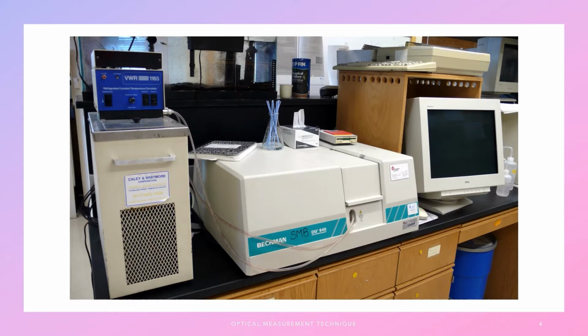Hello, my name is Nabila Aisyah and I will talk about the application of ultraviolet visible spectroscopy. UV visible spectroscopy is widely used in the field of analytical chemistry, especially during the quantitative analysis of a specific analyte. For example, the quantitative analysis of transition metal ions can be achieved with the help of UV visible spectroscopy. Furthermore, the quantitative analysis of conjugated organic compounds can also be done with the help of UV visible spectroscopy.